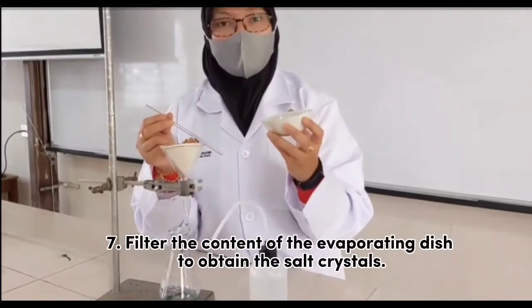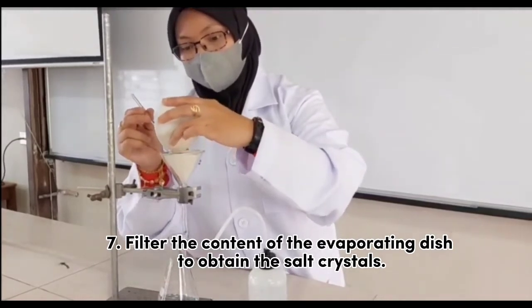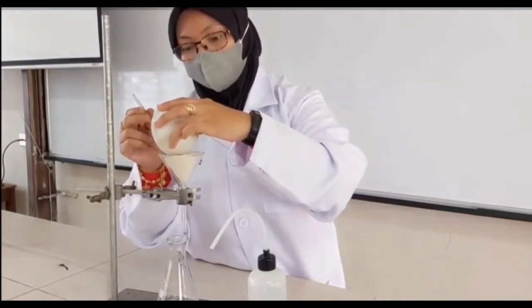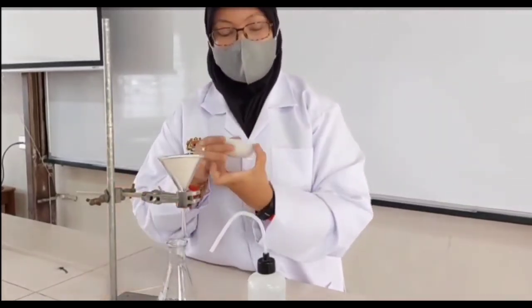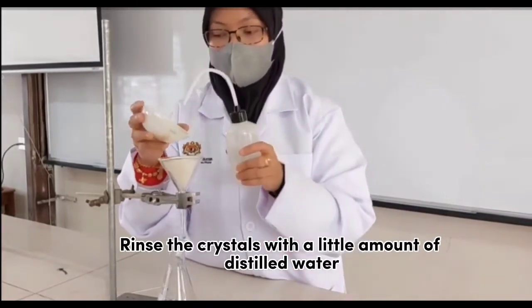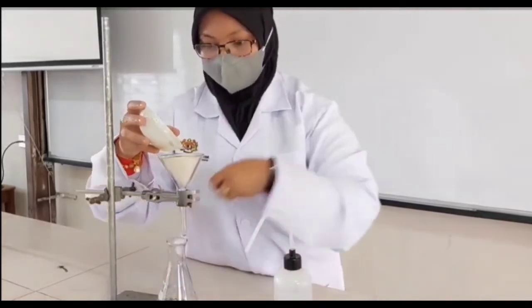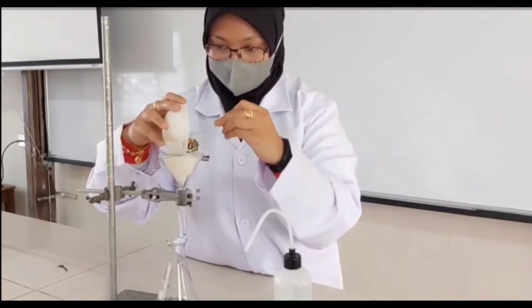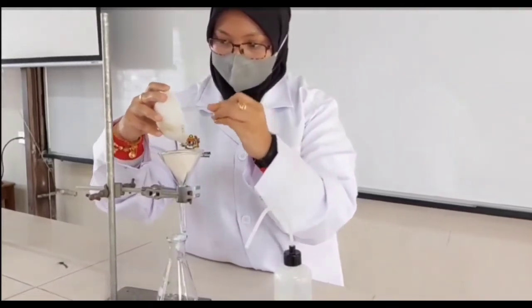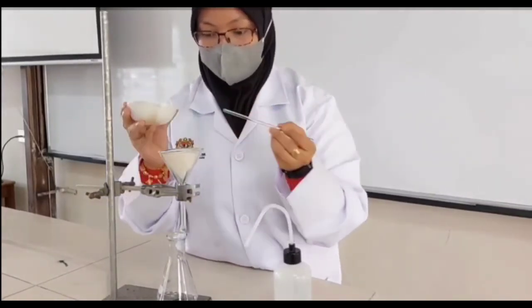Step 7. Filter the content of the evaporating dish to obtain the salt crystals. Rinse the crystals with a little amount of distilled water. Step 8.